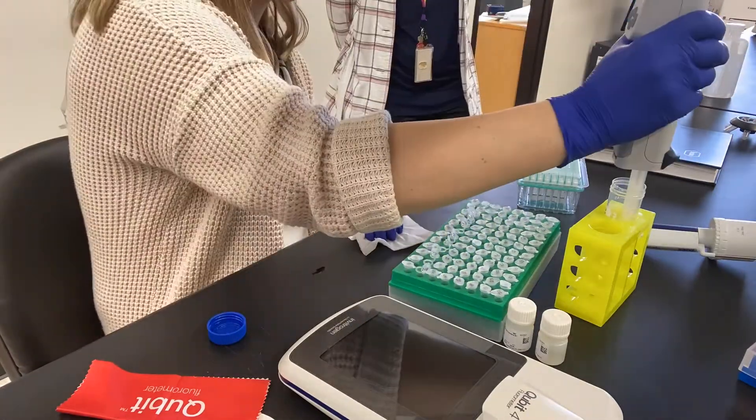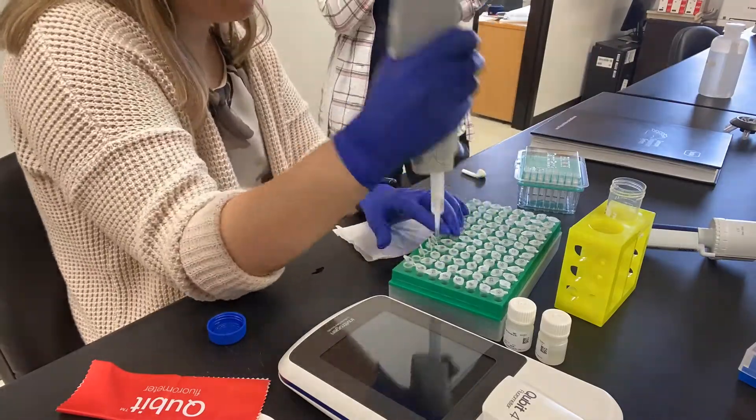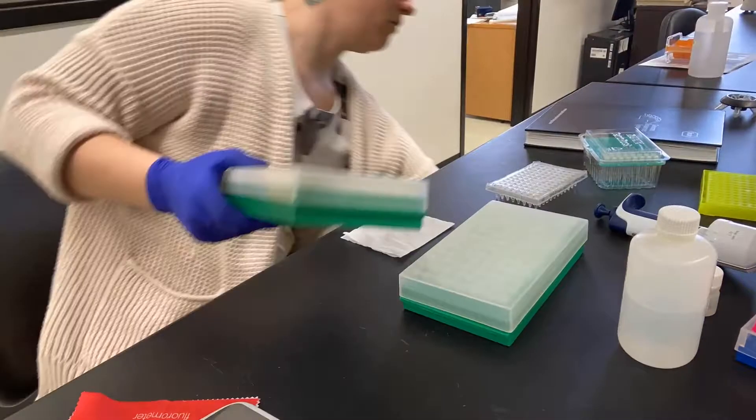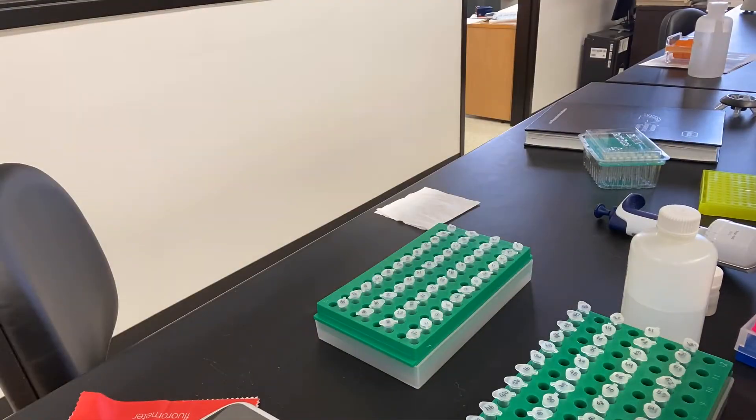Each tube will have a total working volume of 200 microliters. Rather than having tubes in each row, it is easier to open and close tubes if you stagger them every other row, which is what I'm doing now.